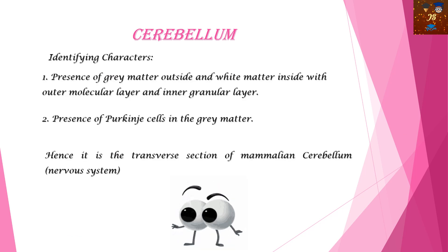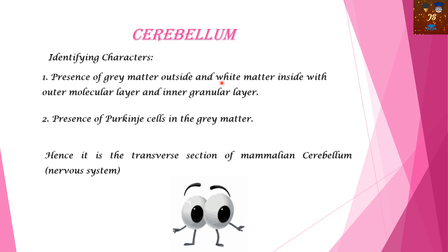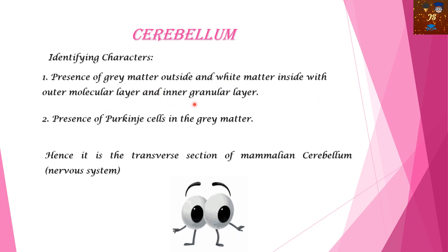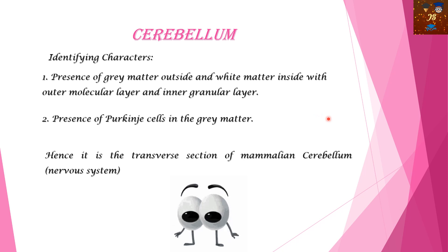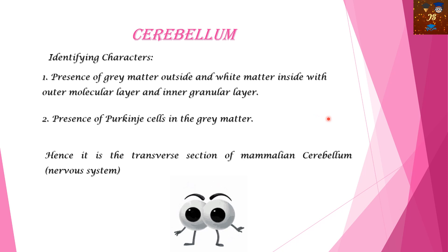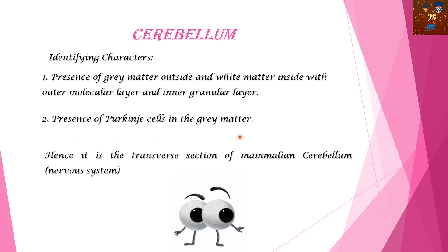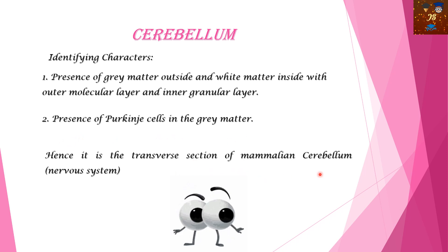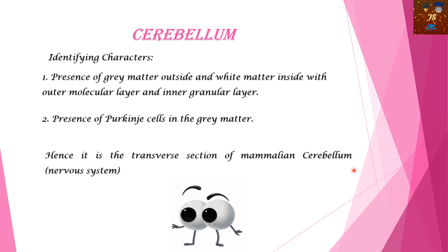Here are the identifying characters for cerebellum: presence of gray matter outside and white matter inside, with an outer molecular layer and inner granular layer, and the presence of a Purkinje cell layer in between. With the presence of Purkinje cells in the gray matter, it is the transverse section of the mammalian cerebellum of the nervous system.